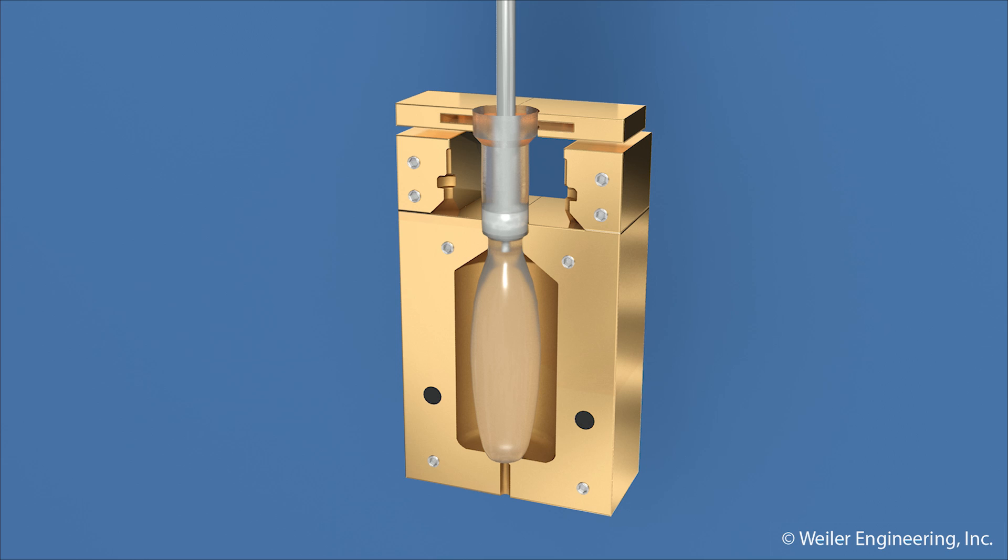Sterile, filtered, compressed air is blown into the parasin expanding it, then is vented out so the sterile product can be metered in through the fill nozzle.